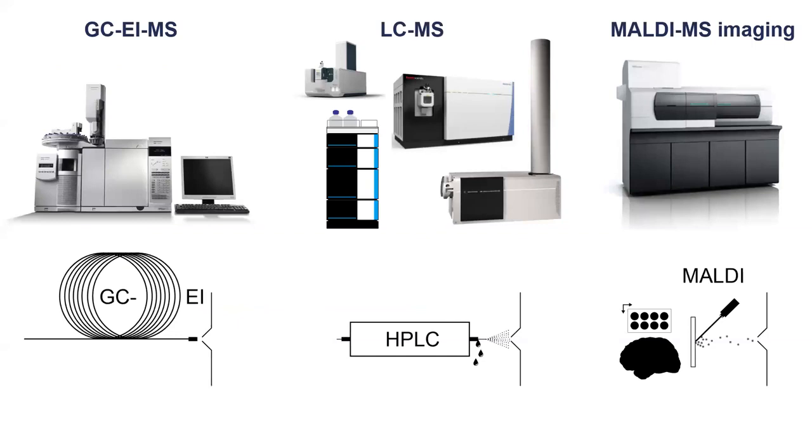And speaking about so many different stuff, here's a very easy setup of what we can actually use as hyphenation. So maybe I can ask around who used GCMS for gas chromatography already, or maybe just in general who used mass spectrometry in general. How about GC? Less people, then liquid chromatography.